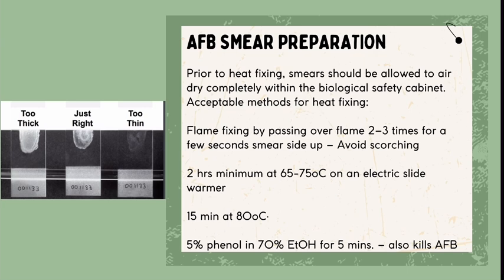And then the next method is 2 hours minimum at a temperature of 65 to 75 degrees Celsius on an electric slide warmer. And then the next method is 5% phenol in 70% ethanol for 5 minutes. But please take note that this method can kill your acid-fast bacteria.